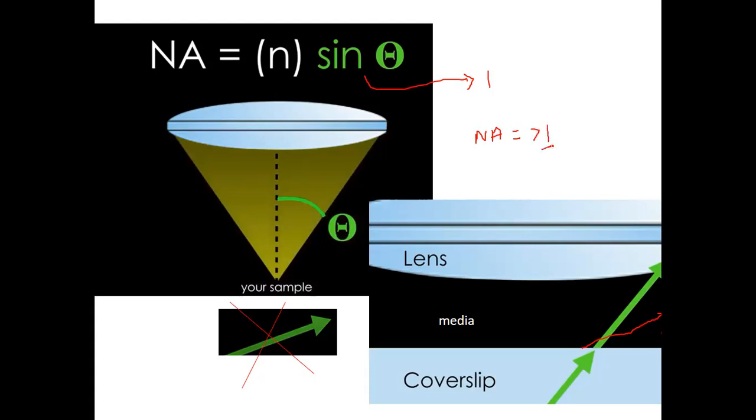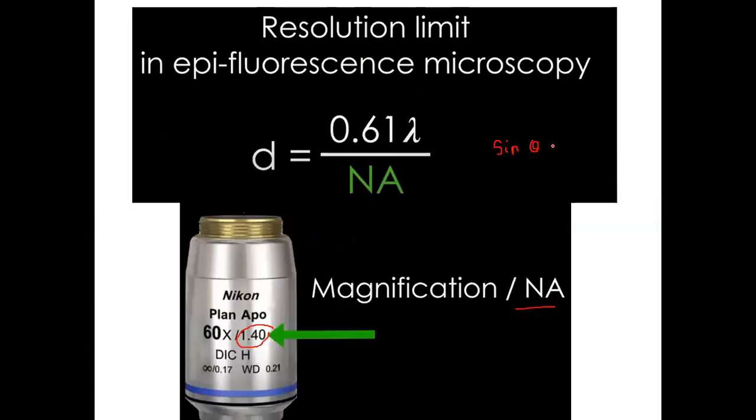Okay, this one is what? It is the refractive index of the vacuum or the room. When you compare it with the room or the vacuum, actually the refractive index is always more than 1. And that is why here you can see that your refractive index or the numerical aperture is always more than 1. So these 2 points are very important, your magnification and your numerical aperture.